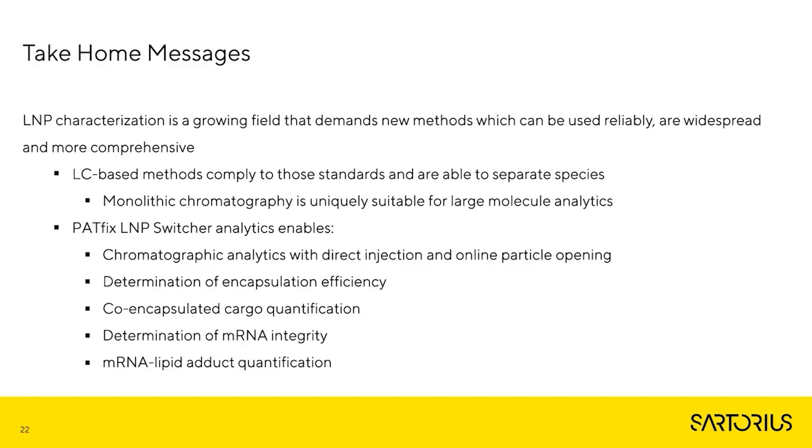That's why we're also introducing and developing LC-based methods that have a long history of doing that, and are especially powerful for separating subspecies. And this is what this sort of a system can do for you. It can analyze a drug product, an RNA LNP drug product, from many different aspects.